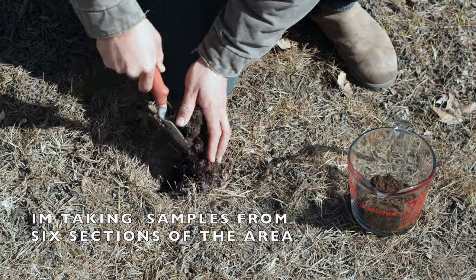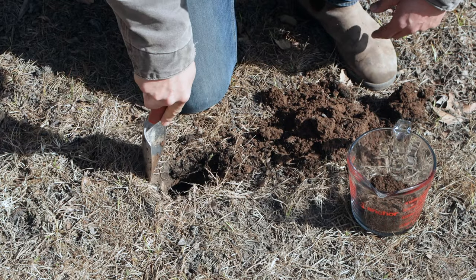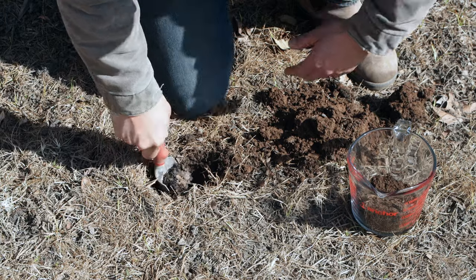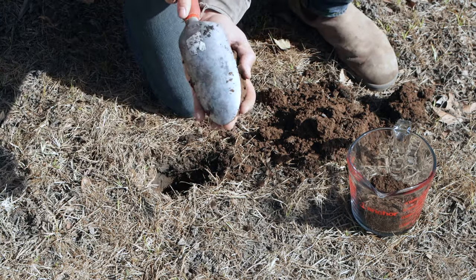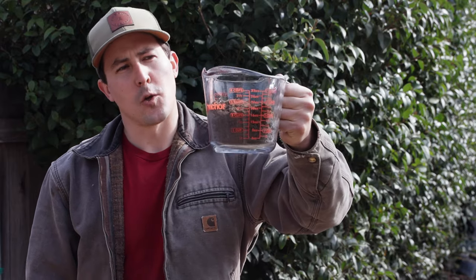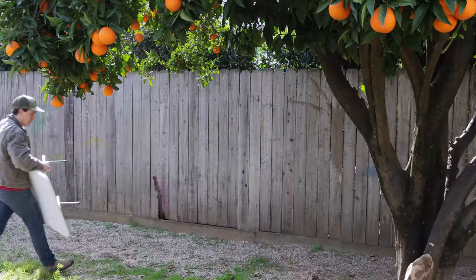I'll start by digging a small hole, about six inches deep. Then I'll take my sample by skimming the edge of that hole so I can get a little bit of each layer. I've got about three cups of soil here, which is plenty for all three of these tests.